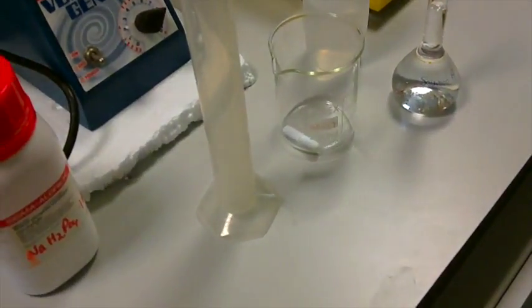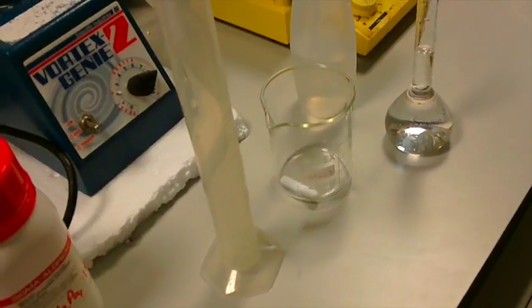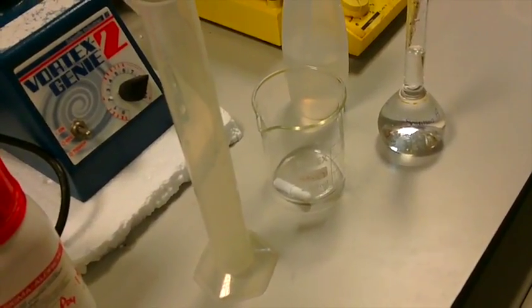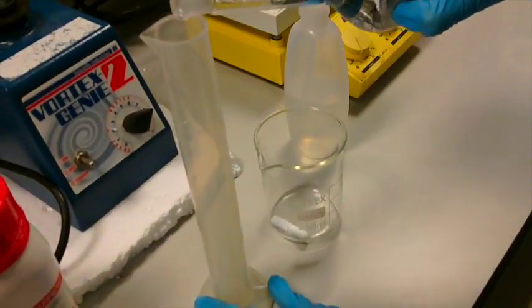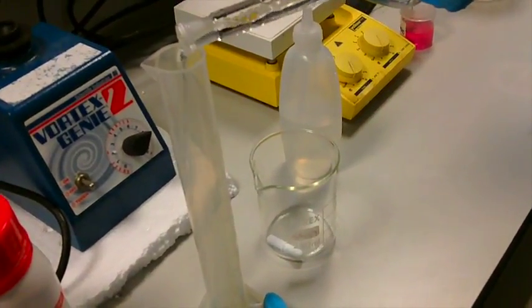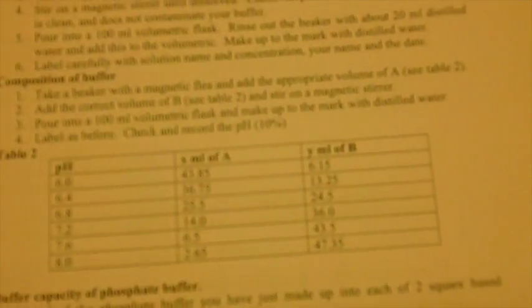For the final part of making up the second buffer, you are going to take the appropriate amount of solution A, adding to the appropriate amount of solution B. This is outlined in the table in your manual. For example, for pH 6, we are going to be adding 43.85 ml of solution A with 6.15 ml of solution B.